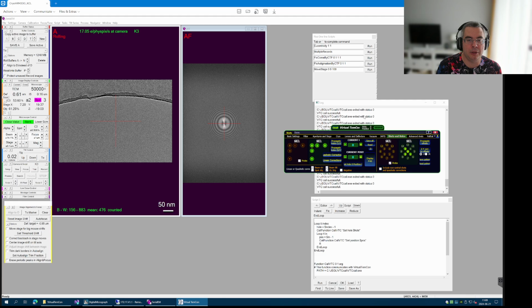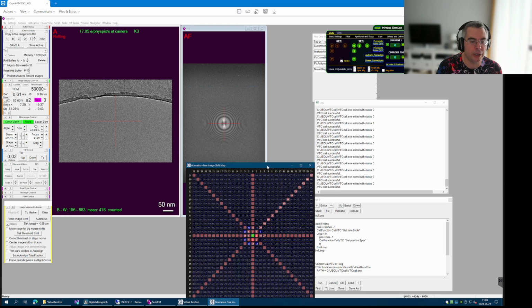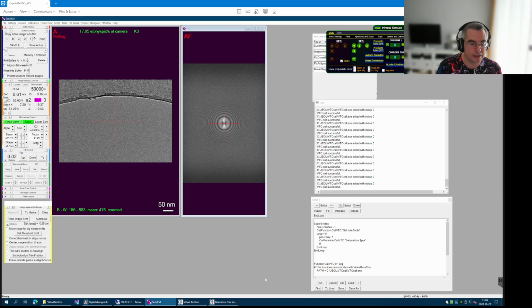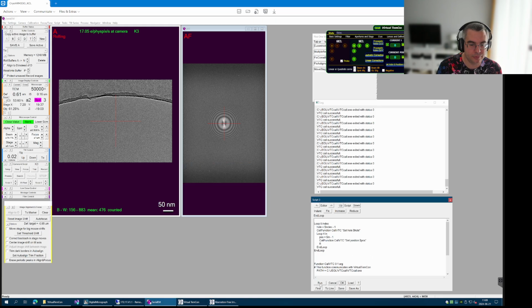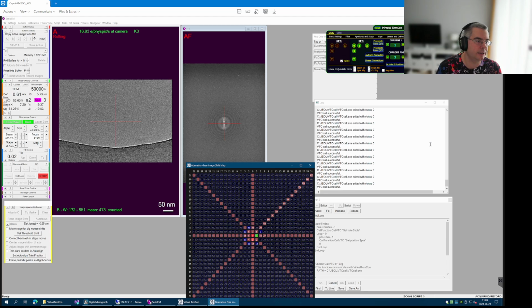I am going maybe to show this one here, and I'm going also to show the map just in a way that doesn't cover the FFT. If I can run. So here we go. That's hole 0, position 1, 2, and 3. Then hole 1, position 0. Tick. Tick. Tick. And tick. Then hole 2.